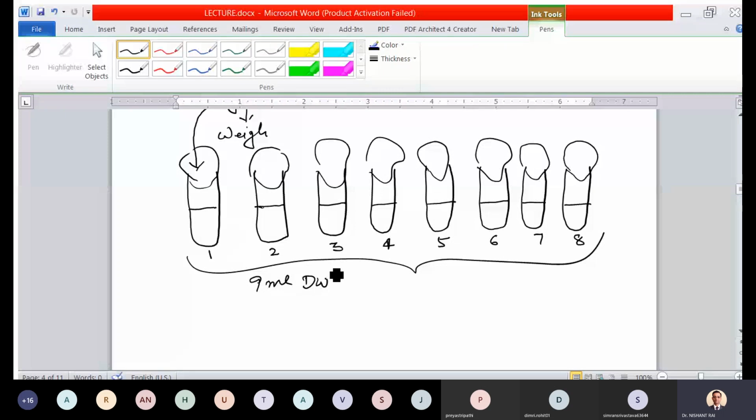That means all the test tubes are sterile test tubes containing distilled water. These test tubes are called as blank test tubes or blank tubes. Blank tubes means tubes containing solvent. Here it is distilled water. If it is not containing anything, we call it as empty tubes.